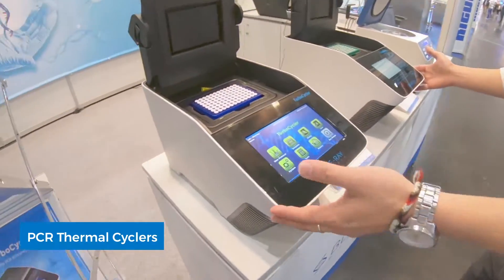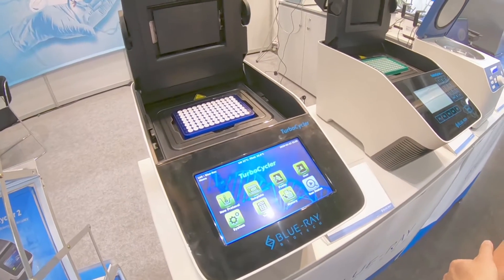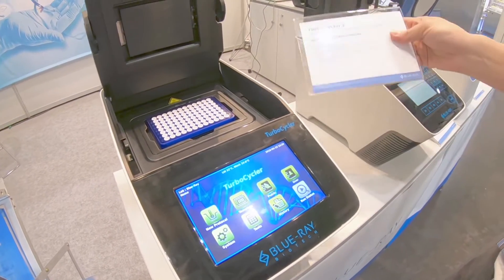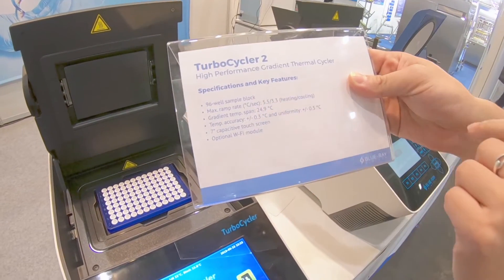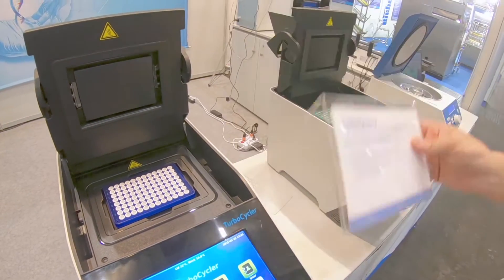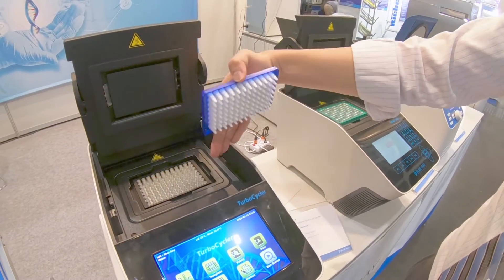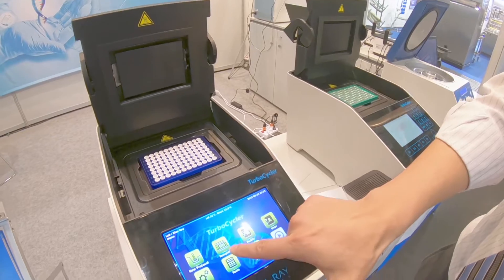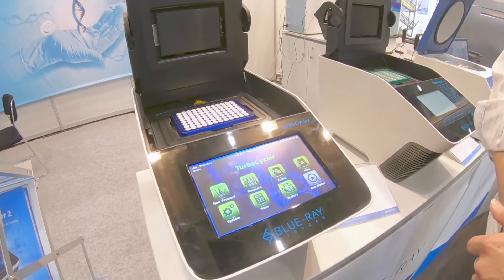The second part is the PCR machine. As you see here, we have two types. The first model has a ramping rate that is really fast — 5.5 degrees per second for heating and 3.3 for cooling. This module also comes with a gradient function, 12-column, touch screen.